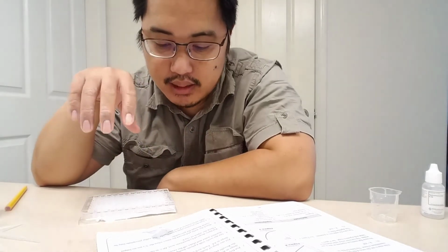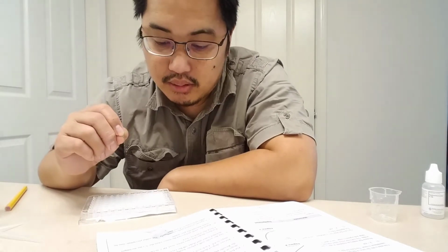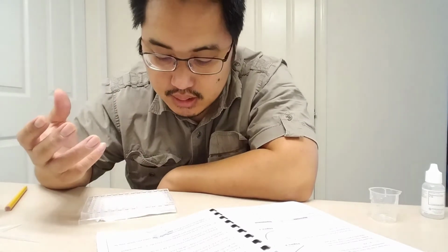So start recording when you think, hey, I cannot see this X anymore, and those are the numbers you record. Some of you might say, hey, I can still very faintly see the X. How do I know when to stop the clock or record the time? My answer to that is, it's really on you. It's to your best discretion to figure it out.